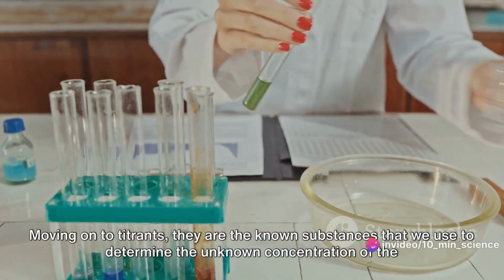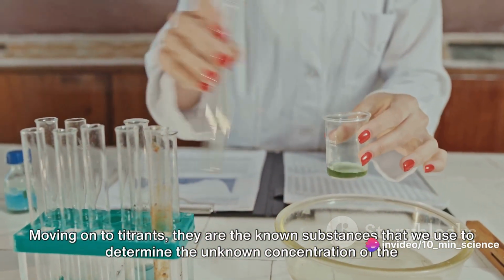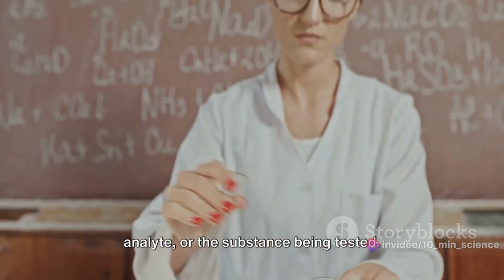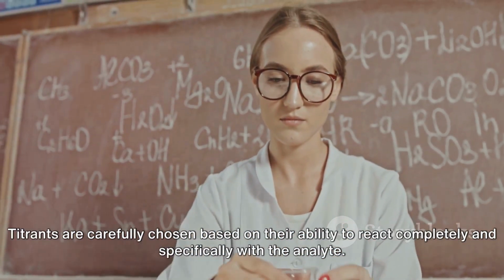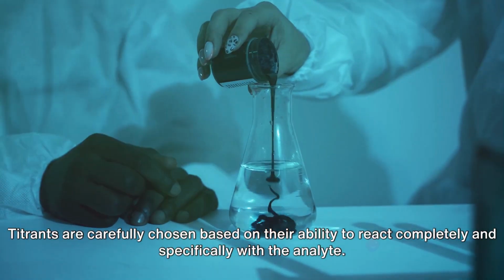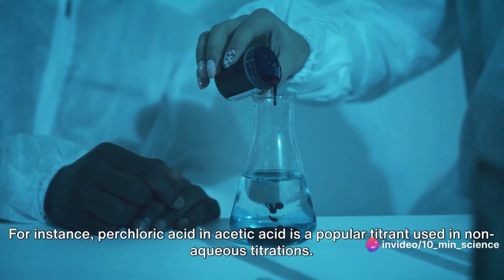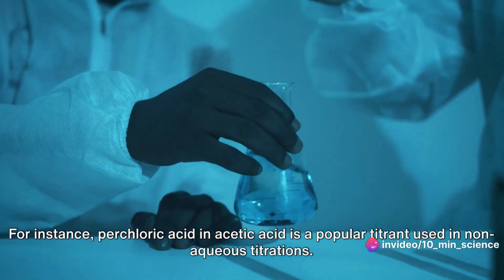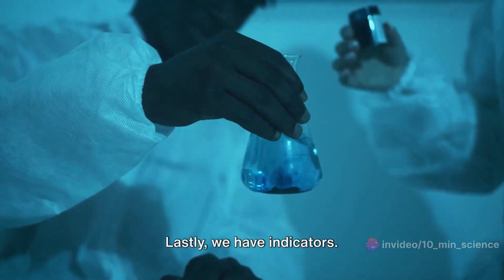Moving on to titrants. They are the known substances that we use to determine the unknown concentration of the analyte, or the substance being tested. Titrants are carefully chosen based on their ability to react completely and specifically with the analyte. For instance, perchloric acid in acetic acid is a popular titrant used in non-aqueous titrations.